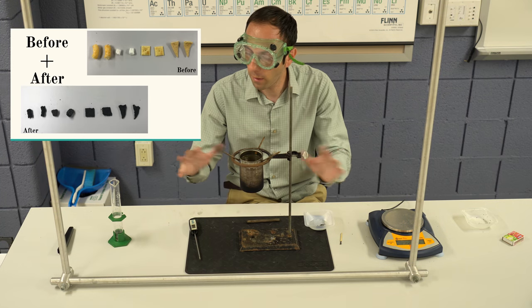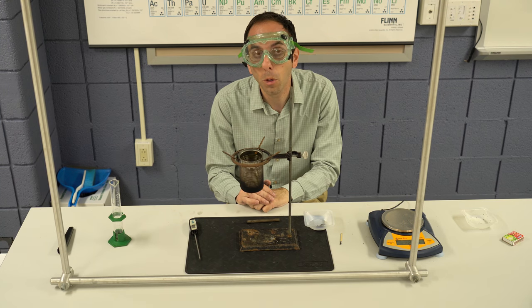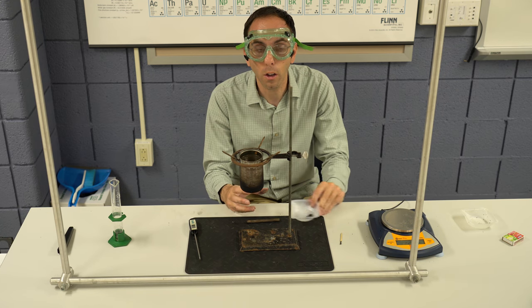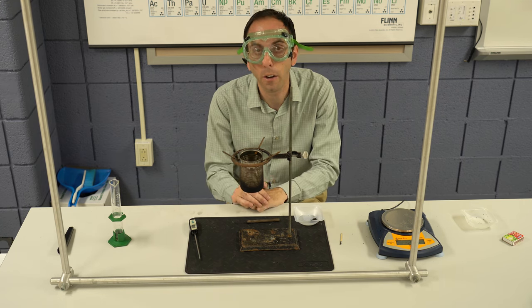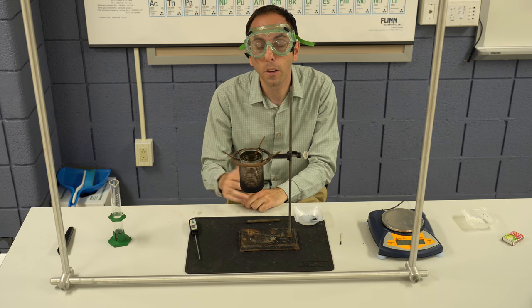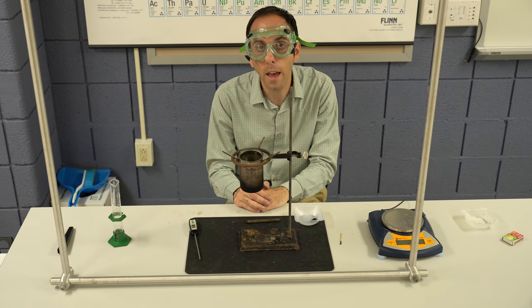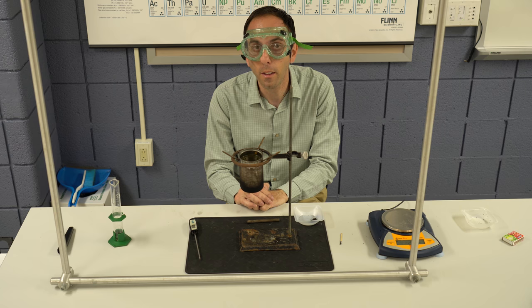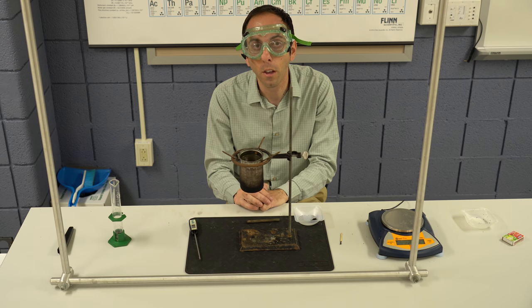So keep in mind that this is a great setup and you should also be doing repeated trials because while it'll be different masses for your food, it should all come out in the math because of the calculations you're doing, but always good to have repeated trials. It's fun to think about too, if you have a collection of snacks, which food item do you think has the most energy to be able to go through and compare to see if your hypothesis or your prediction was correct.